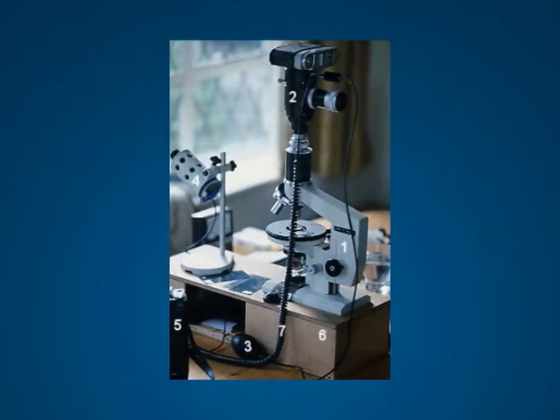A person should be well conversant with the principles and procedures of the microscope and cameras. The microscope opened a new horizon for mankind as well as in the scientific domain. Many academic studies and research are taking shape due to the microscope. For the study of tiny objects and activities in the fields of medical, microbiology, industry, engineering and forensic science, etc., photomicrography becomes an important need.